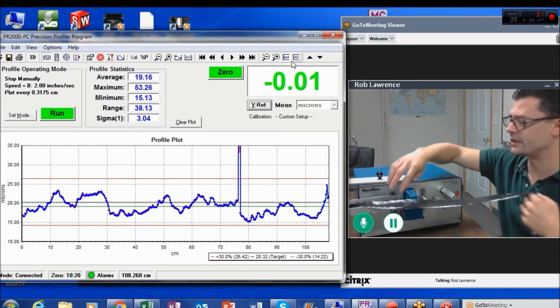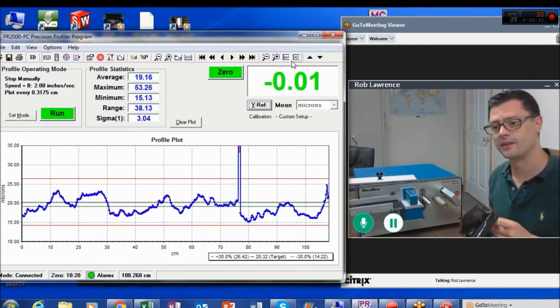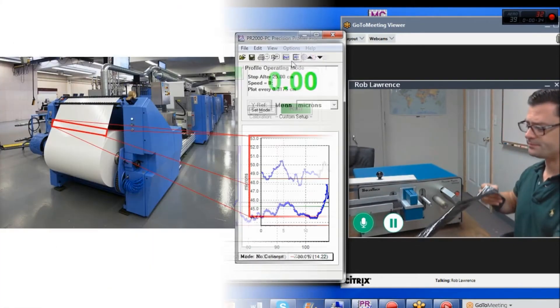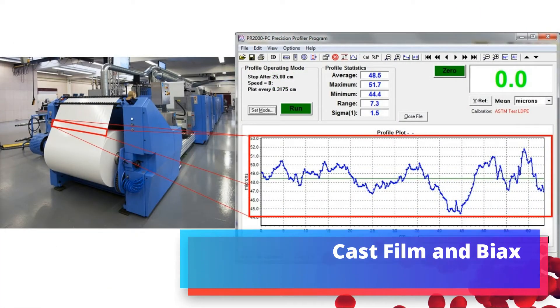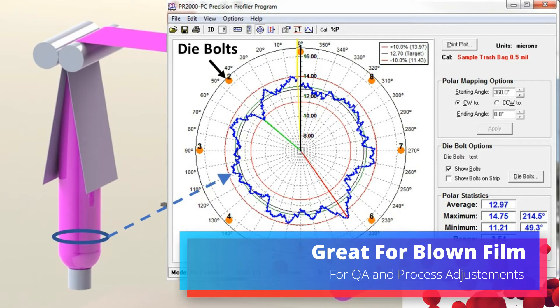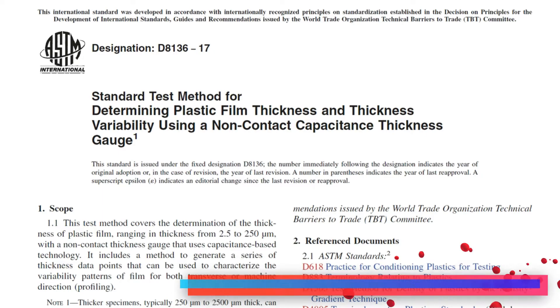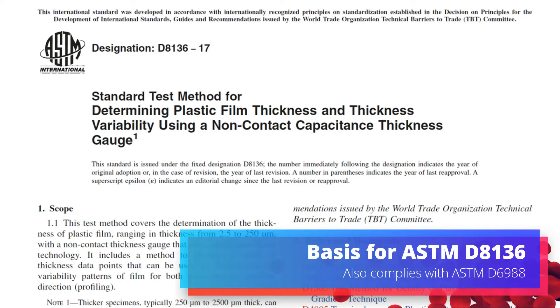The profiler takes a strip of plastic film, which represents your extrusion, and profiles it to see the thickness and variability along the extrusion. In cast film, we're taking a strip across the cross web, and in blown film, we take a loop around the bubble, and we can overlay that over die bolt patterns. The device fully complies with D8136 and D6988 for measuring the thickness of plastic film.